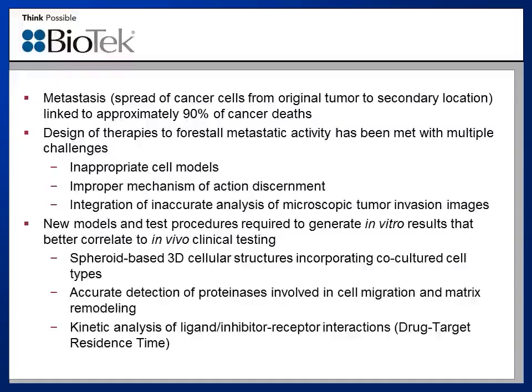Second hurdle, as I mentioned previously, is accurate mechanism of action determination. Possessing accurate knowledge of how invasion is interrupted provides a more complete picture before proceeding to clinical testing.